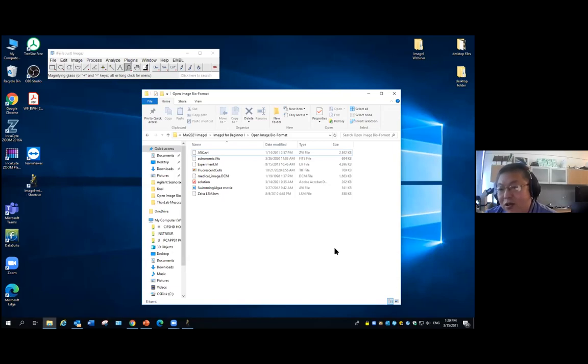And when you say save as JPEG, you automatically agree that it's okay to change the pixel intensity. Once you change the pixel intensity, we can't really do any kind of measurements on it. It's not reliable because it's not the same as a raw image. And to show you this, we will go to an example.